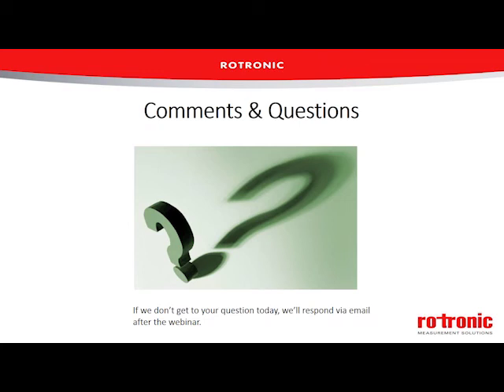This is from Gadiel. I think I said that right. Can an instrument be calibrated to tighter specifications than those stated by the manufacturer?